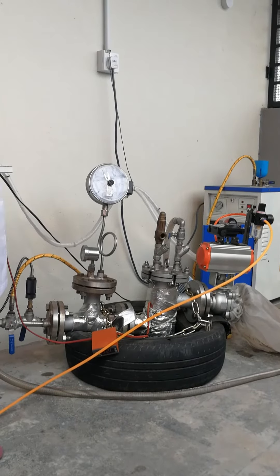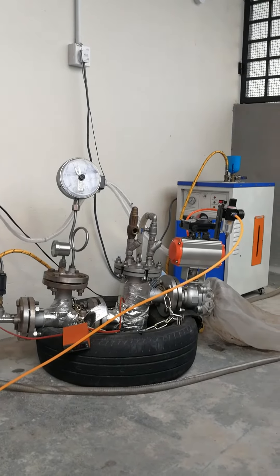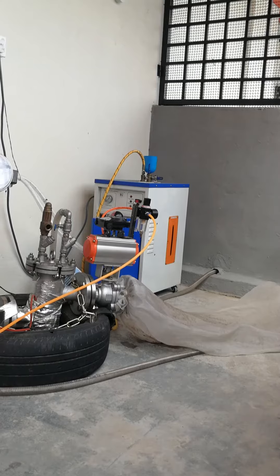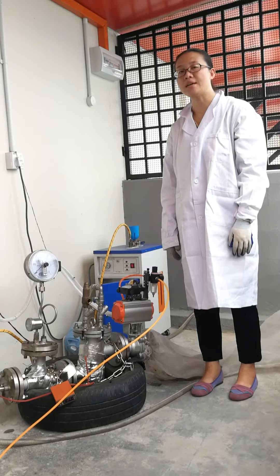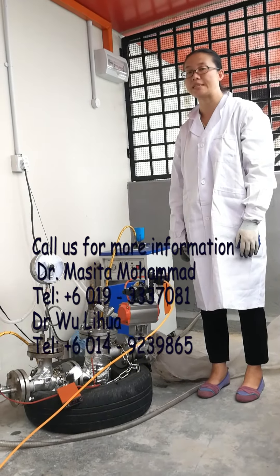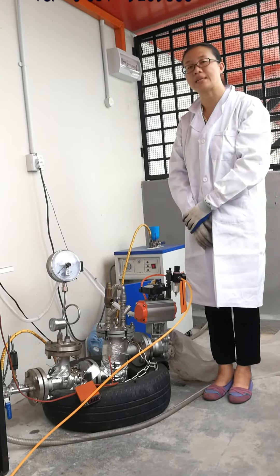After finishing the treatment time, we will release the pressure and start the explosion process. We turn on the pneumatic valve to let the pressure release immediately. We have now finished one experiment of air steam explosion under temperature and pressure control conditions. The next step is to collect our sample and clean the system.